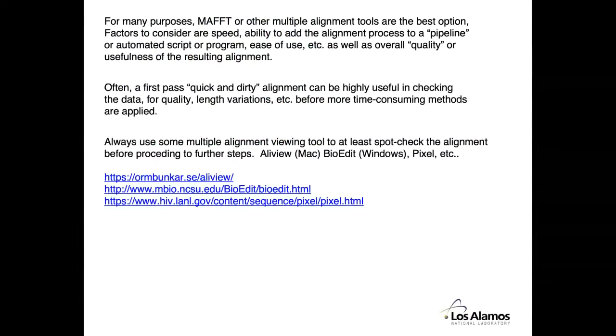And I've tried a lot of other tools on the web. There are many servers out there where you can supposedly get your gene or genome aligned in frame. And for some of those, it can take up to a month to get your results back. This is a fairly large alignment, thousands of sequences. But I'm waiting a month for my results. I get my results back at the end of the month, and it's like, dang, that's not any better than what I sent in. So it's really worthwhile to make sure that what you're sending in the first place is good, and also test drive some of these on a fairly small data set before you wait a month for results.